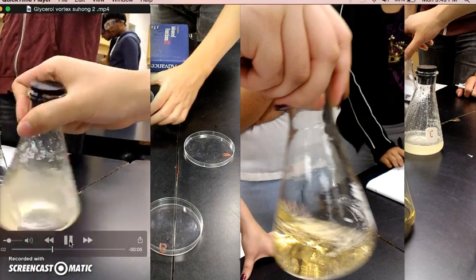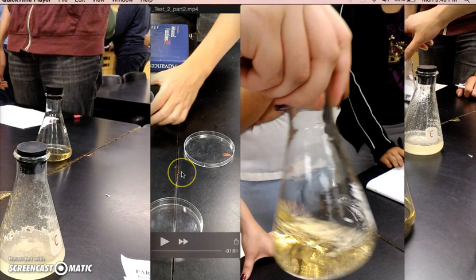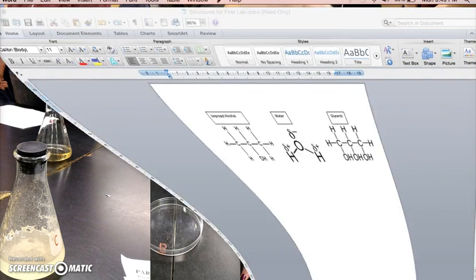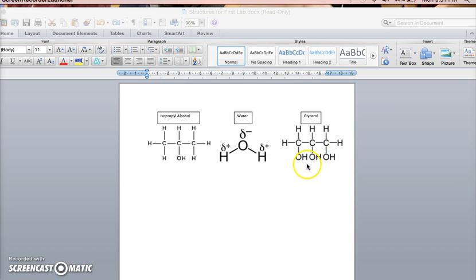Okay, so this is C spinning. And as you can see, as my voice was also telling you, it just stops. This means that it has the highest surface tension, and this is due to the intermolecular forces that can be seen within the structure. We see that glycerol has the most forces acting within it, with three sets of hydrogen bonding as well as dipole-dipole forces. And the more dipole-dipole forces, the greater the surface tension will be. A higher surface tension would also be expected from liquids that have a higher net polarity. And as there are more dipole-dipole forces going on in glycerol, there is therefore a higher polarity.